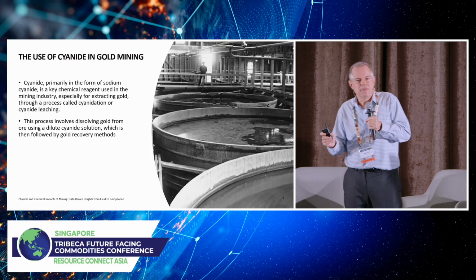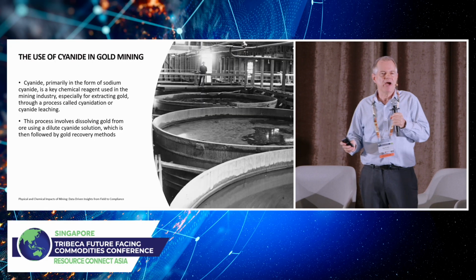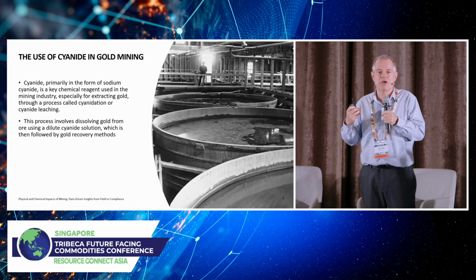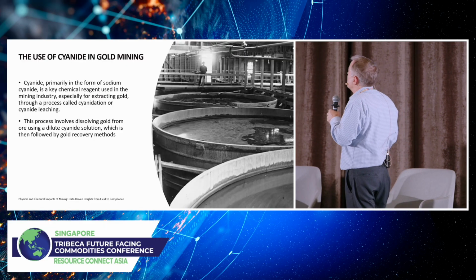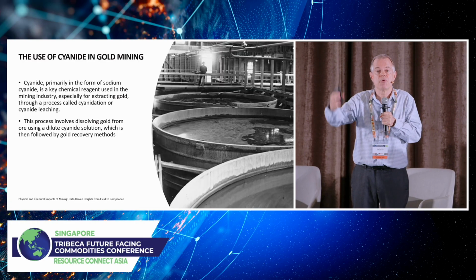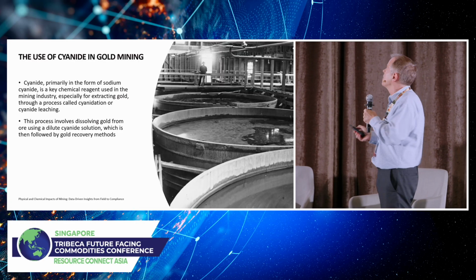But the gold mines have another problem. The cyanide doesn't just bind to gold, it also binds to all the other metals in the crushed rock, including toxic metals. And the mining company likes to use the lab to help them quantify this problem, the cyanometallic complex species.